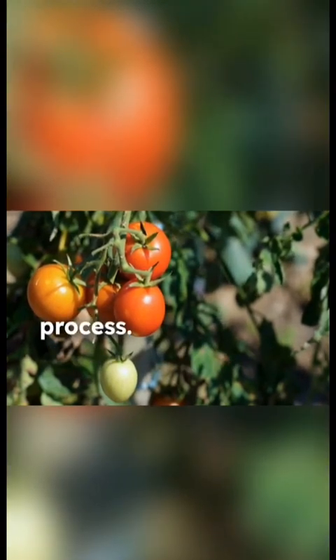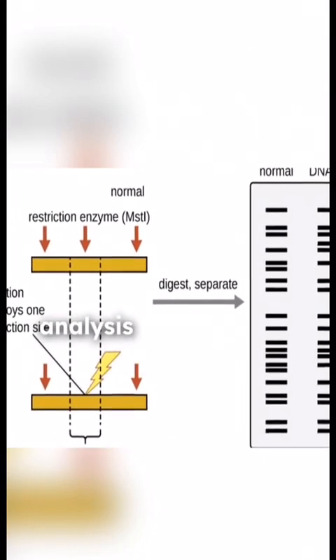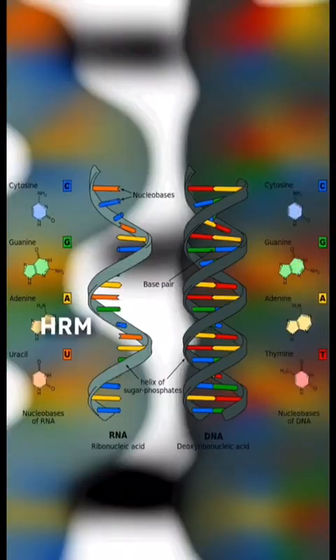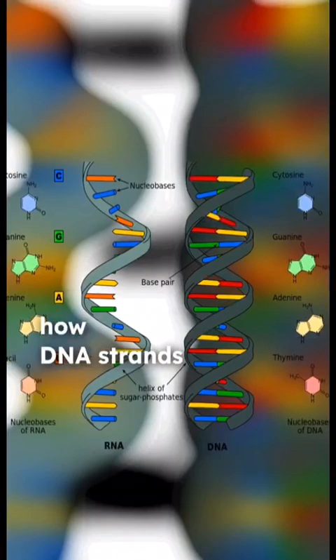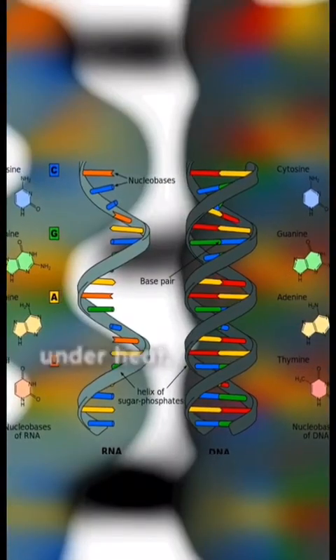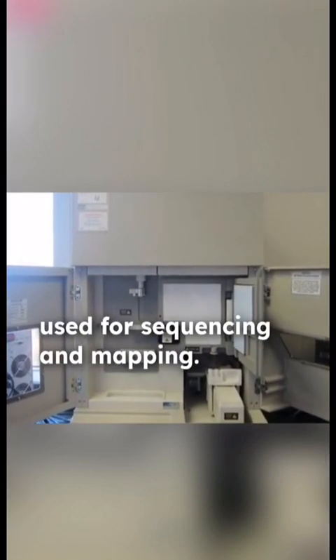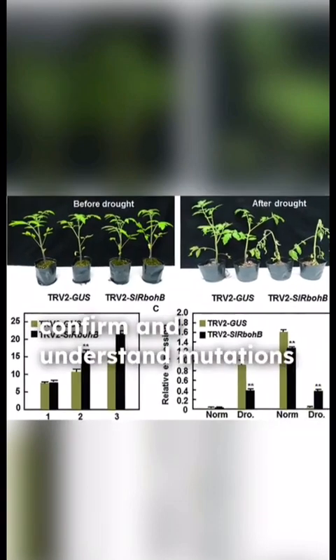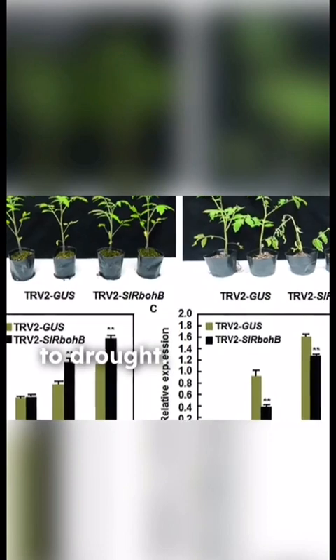process. Mutation analysis. High-resolution melt (HRM) analysis is performed to detect DNA variations. HRM helps identify mutations with high precision by studying how DNA strands separate under heat. Once mutations are detected, tools like the ABI 3130XL are used for sequencing and mapping. This allows researchers to confirm and understand mutations that, for example, make tomatoes more resistant to drought.